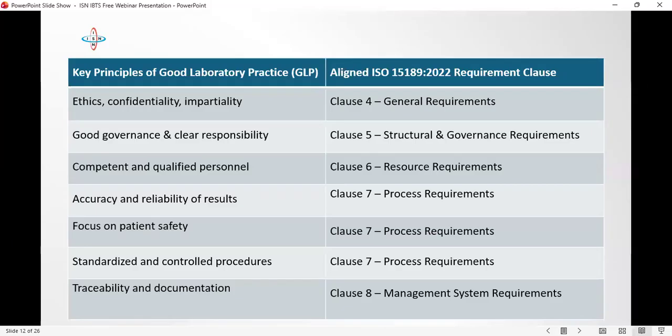And they have to be traceable. Traceability in the sense that, you know how you have the HIV package inserts? Your process is, if you are using that strip, everybody must follow the protocol. If it says allowed to stand for 15 minutes, anything after 15 minutes, do not accept.